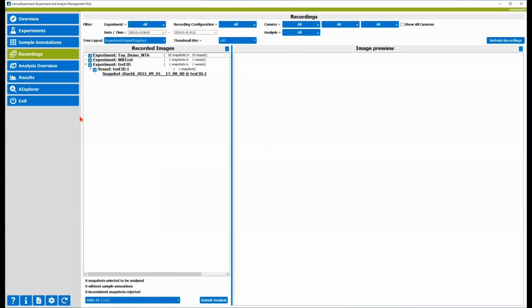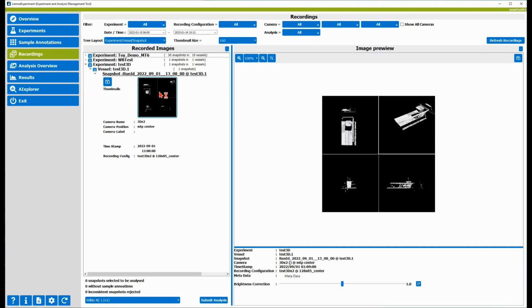Let's continue with an example of a 3D data scan. The preview thumbnail of the 3D scan contains 4 rendered views from different sides: front, top, right, and a diagonal position. It takes a moment to open the 3D object in the preview. During the start process, the aforementioned preview image is displayed.